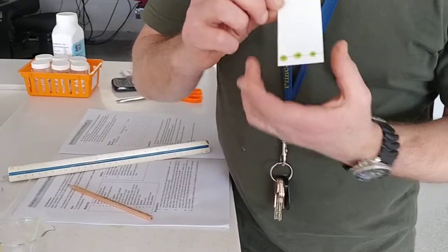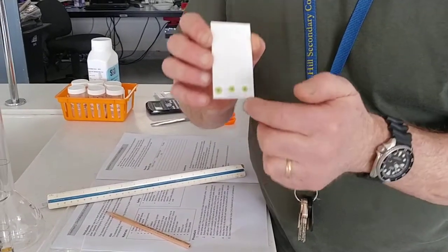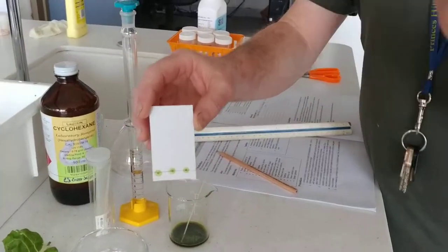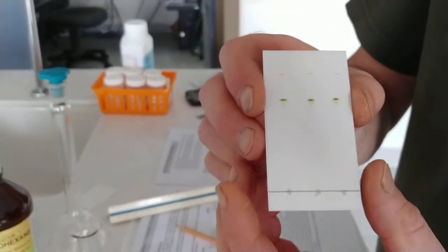So now we have our baseline. We're running 3 samples, and now we pop it into our solution. So we put it into our solution, and 15 minutes later, like that, we pull it out, and we have our 3 dots moving up the thin layer chromatography plate.